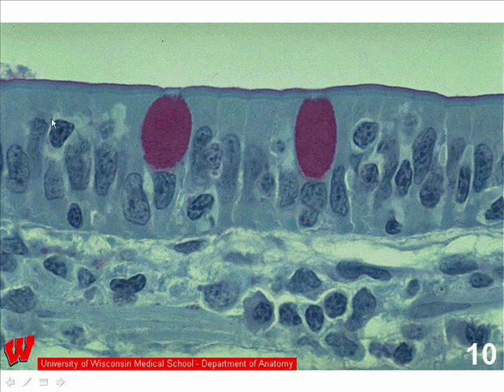So these lymphocytes are constantly scanning through the epithelium of the gut to prevent any sort of invasion of bacteria or other material that's in the lumen that should not enter into the connective tissue space beneath.